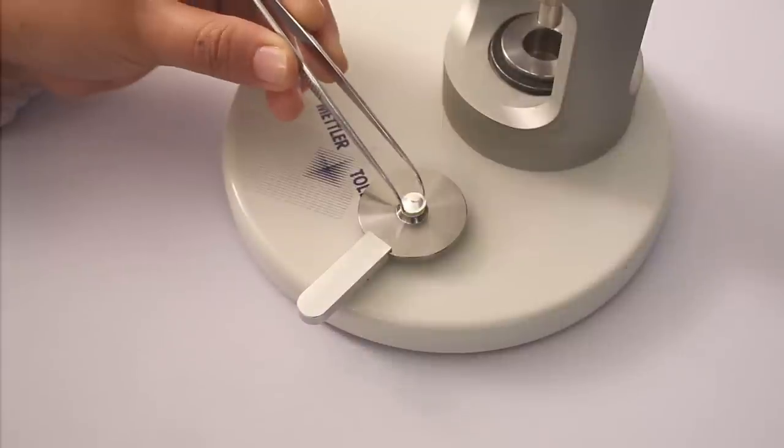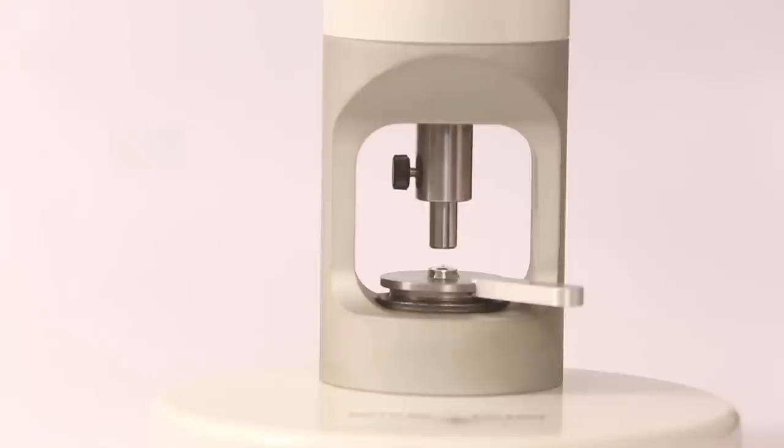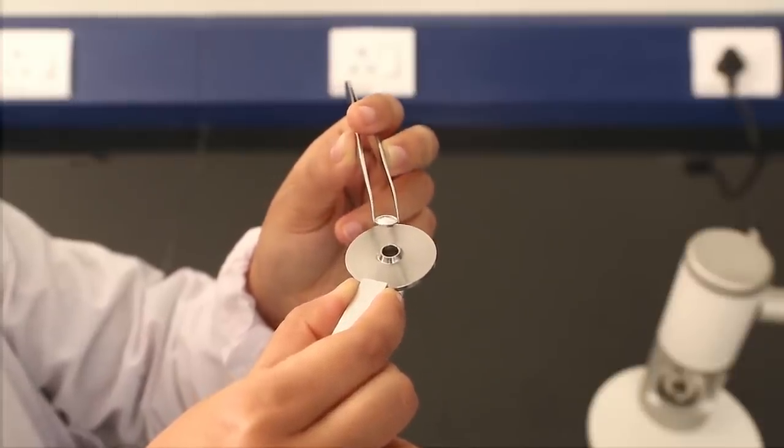Close the crucible using the crucible press. Place the crucible on the die of the press. Apply the crucible lid. Center it and rotate the lever to move the plunger down until its resistance is overcome. The lid is now cold welded to the crucible rim.